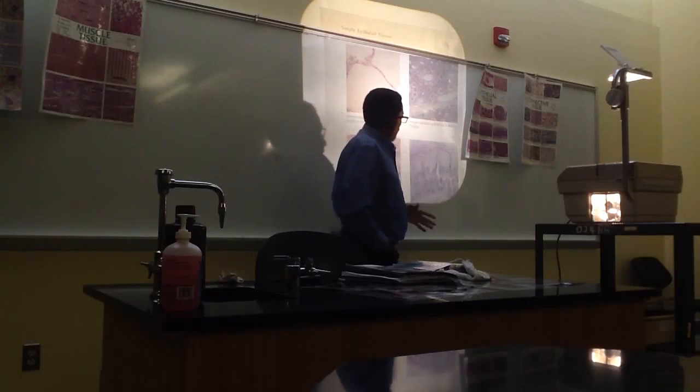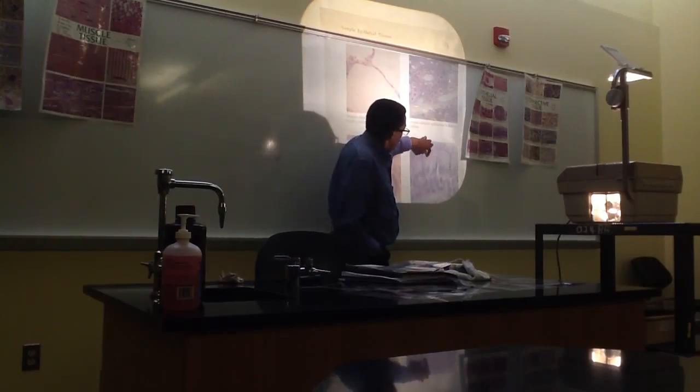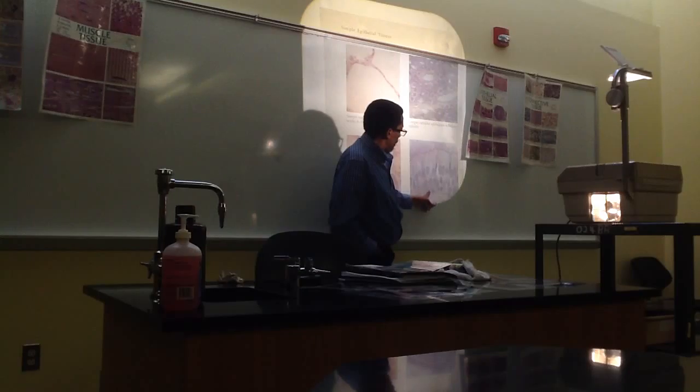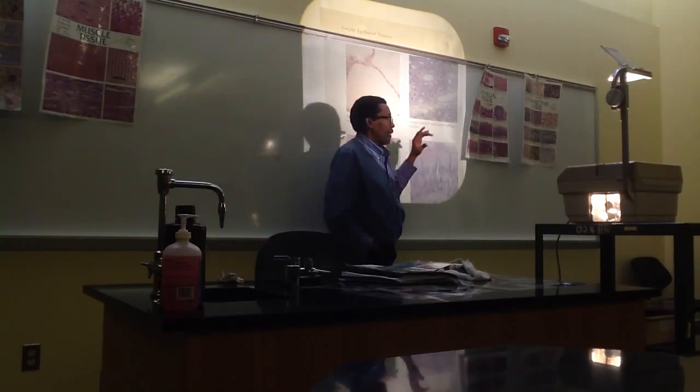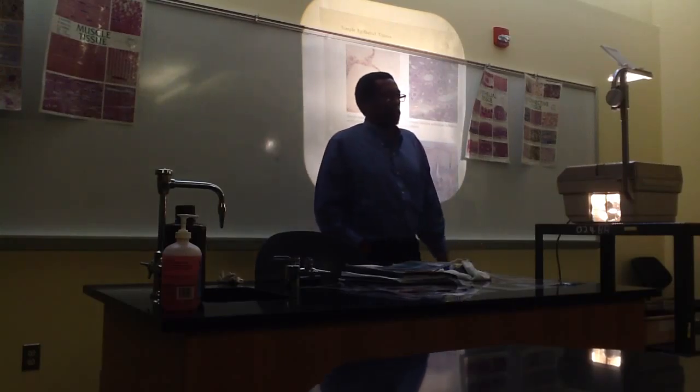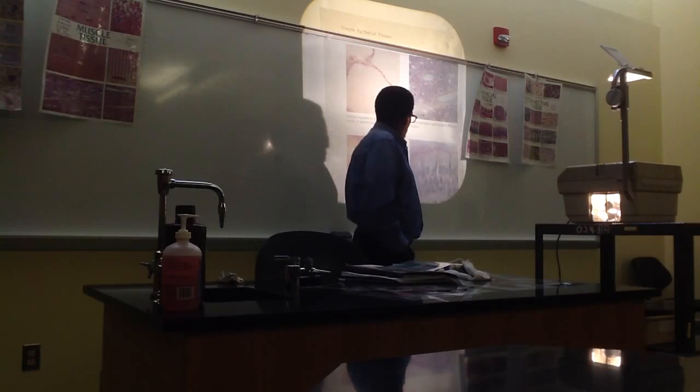All right, this one was like the transitional in that you had some big cells up here, but the experts had to tell us that this cell reaches all the way down to the basement membrane here. These cells are just in front of it, down here. You can see the brush border. You will barely see the brush border at 400x, but it will be there.